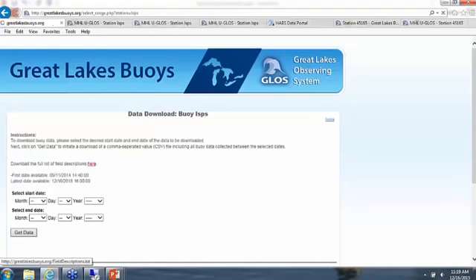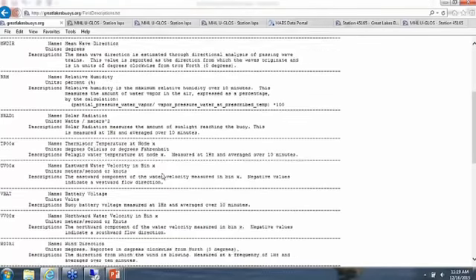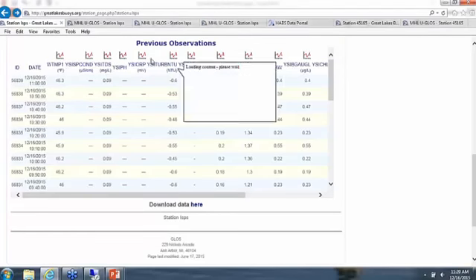Also included here is a list of descriptions of what all the different abbreviations mean that pop up when you download the data or look at it on that screen. Not everybody knows what the YSI term NTU means, right? It's just an abbreviation for turbidity. This one is fairly straightforward because it has conductivity, total dissolved solids, and oxidation reduction potential, things that we commonly know. The fun one to look at is the one from the buoy that has all the weather data on it. That can get really interesting when you try to figure out what all that stuff is.